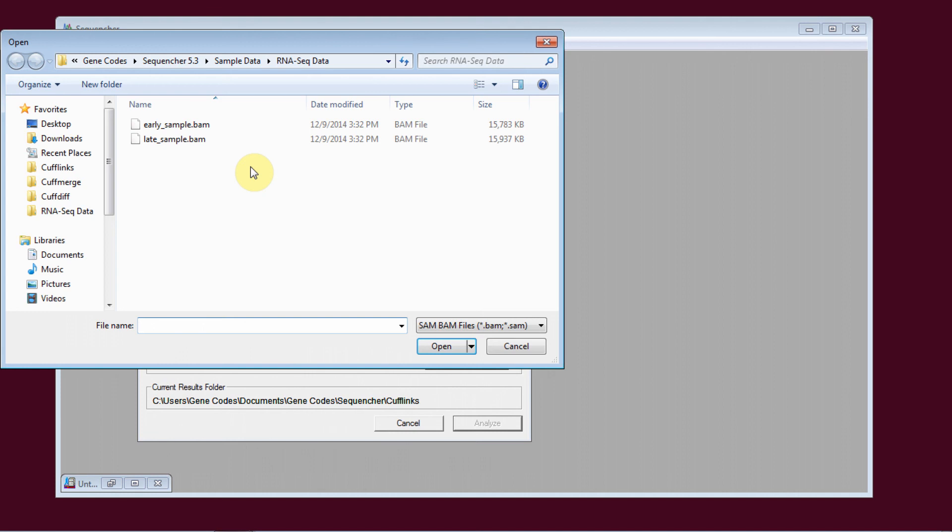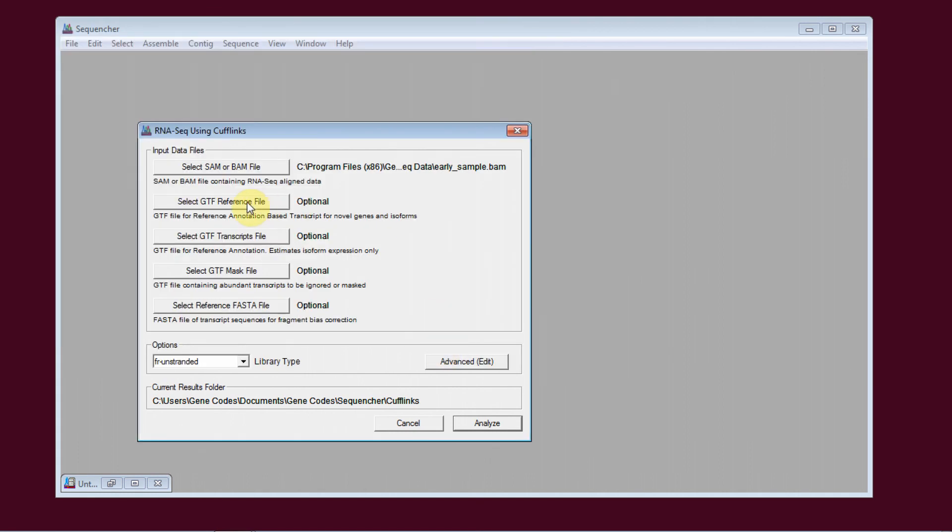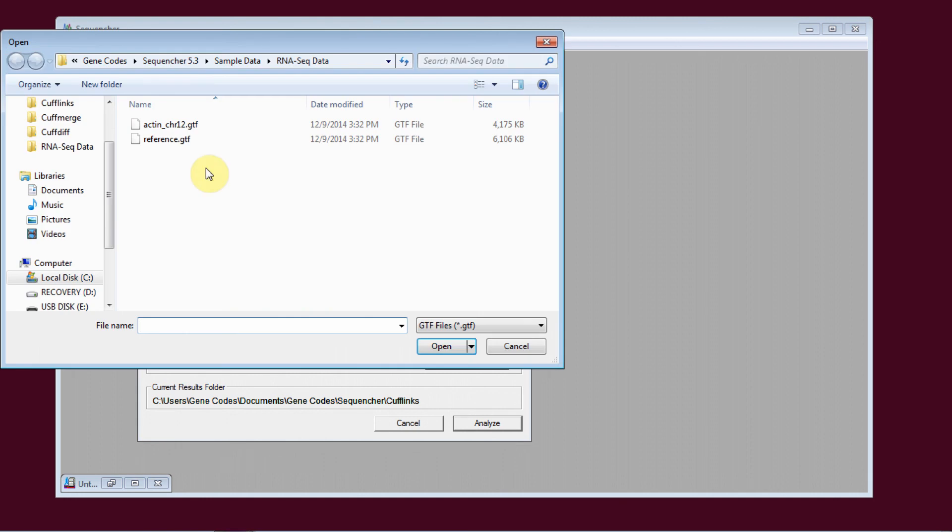You tell Sequenture where your reads file is. I'm also going to select a reference file, since we have one.